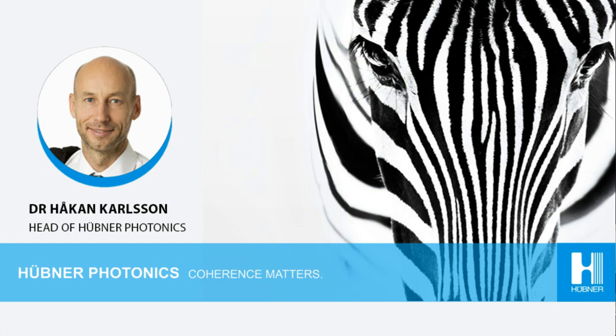So if the laser light is highly polarized, you can get some information about the orientation of the crystal structures or the molecules, which I guess was important in this study of the molecular machines, where they were studying the rotation of those molecules.